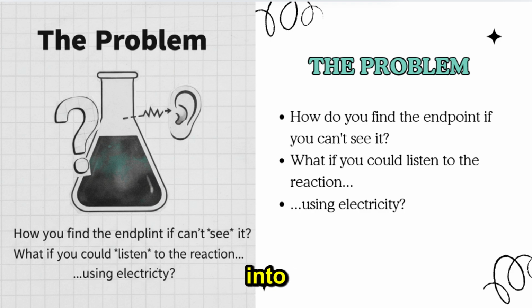Today, we're diving into a powerful technique called conductometric titration. It's a fancy name, but the idea is brilliantly simple. We're going to track a reaction by measuring how well the solution conducts electricity.